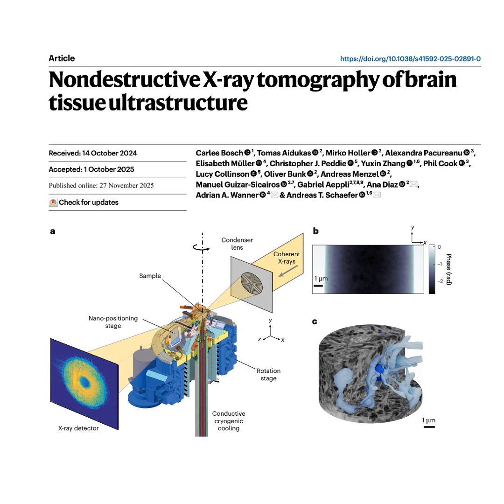For sure. And when they switched to the TGPAP samples, which were imaged at a much higher dose, the identification rate got better. The blind analysis showed that over 2/3 of the synapses confirmed by FIB-SEM were reliably recognized in the PXCT images, specifically 70% plus or minus 6%. And that's the functional proof, isn't it? The ability to withstand a higher dose directly translates into better, more reliable science.